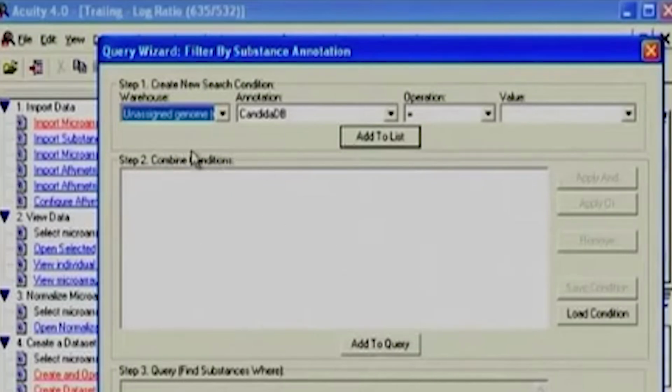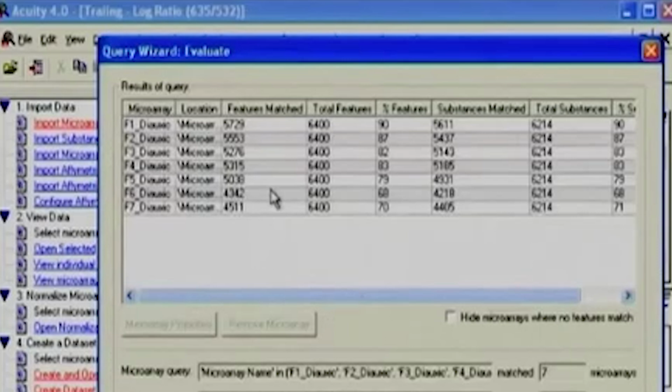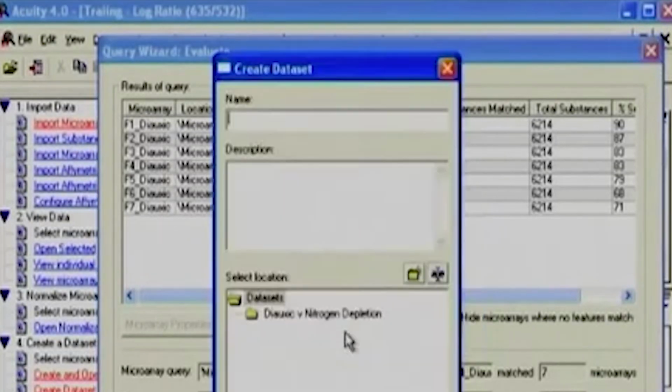You can even select the database on the basis of annotation and filter only with our mitochondrial specific. So it depends on what questions you are asking. So quickly look at only that what you are saying. It says how many of them are there in that. So it reduced the numbers. So in this fashion, I can import a limited number of database as well, right? I can give a name to it like filtered, and it will be imported.